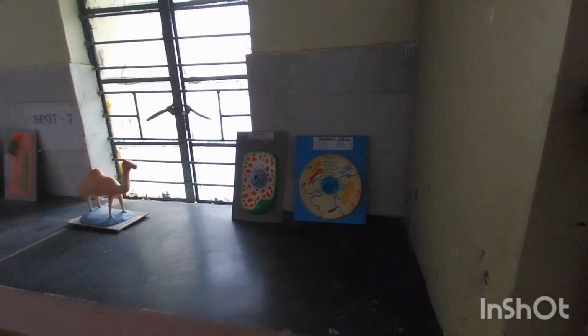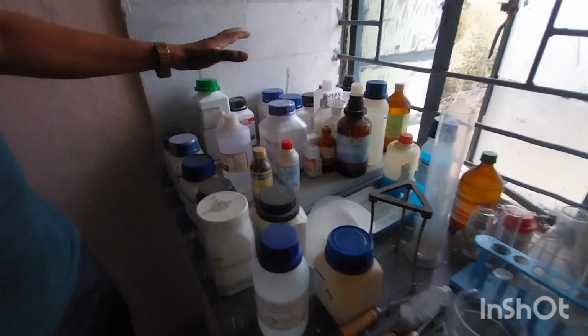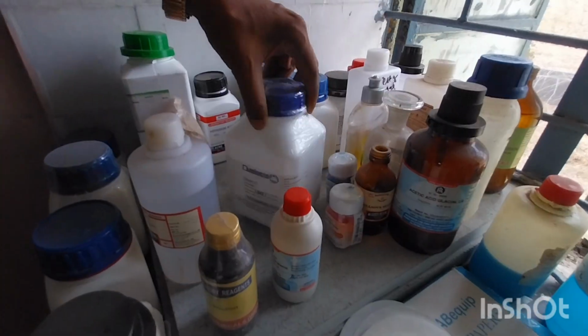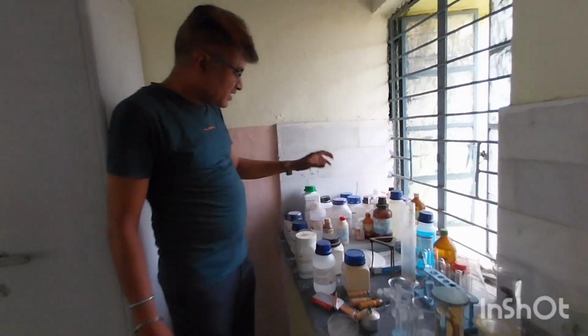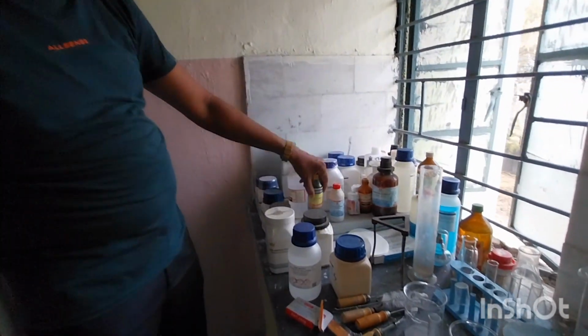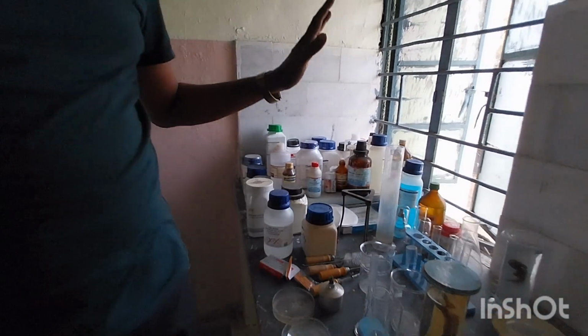Now come. Chemicals. Here we can see the chemicals. Different types of chemicals here. And these chemicals are used to test in the biological laboratory. And also stains are there. Safranin stain here, eosin stain here. These are used to color the slides, to see the slides in colorful ways.